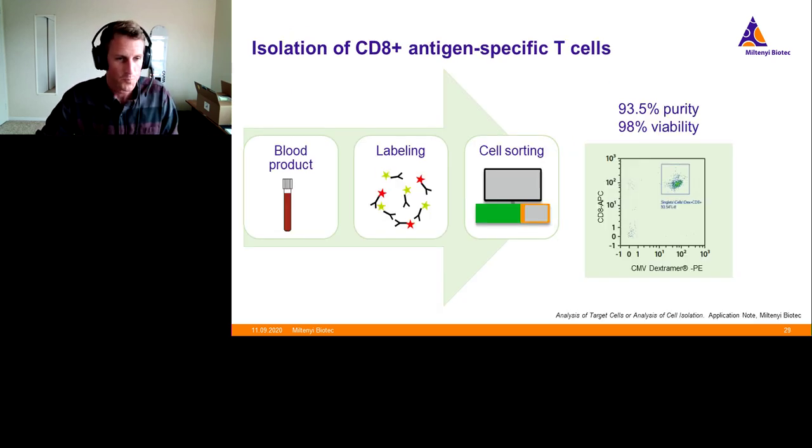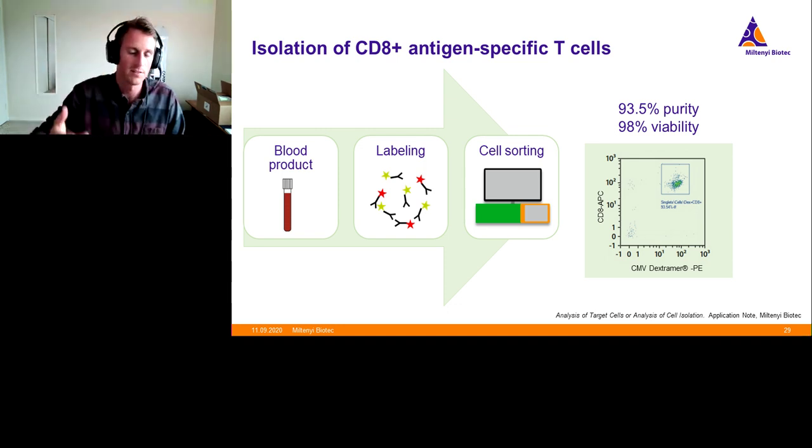And so what I'll show you here is information from an antigen-specific T cell sort that's been done as part of a therapy. And this cell sorting, I think the material starts at like 0.1% of the targets. Yeah, I'm realizing I didn't put that on this slide. But antigen-specific T cell sorts are always with very, very low starting targets. And they are able to pull up to 94% purity in a single sort. So this is a workflow that's being implemented in a clinical trial currently. So I'll touch on a couple other things, but I want to come back to that point too.